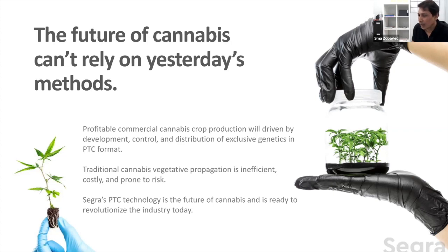Sometimes I receive plants which in a month are really good, and in 3 months' time we start producing stage 2 or stage 3. We receive that kind of plants also, but in most cases, compared with the horticulture industry, there is a lot of intercellular bacteria we need to clean.